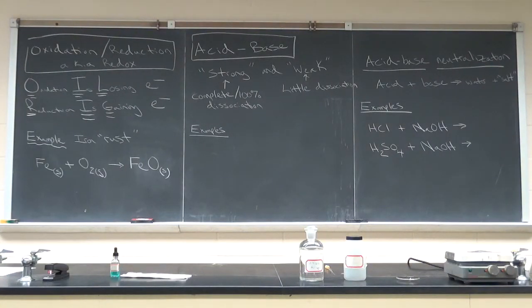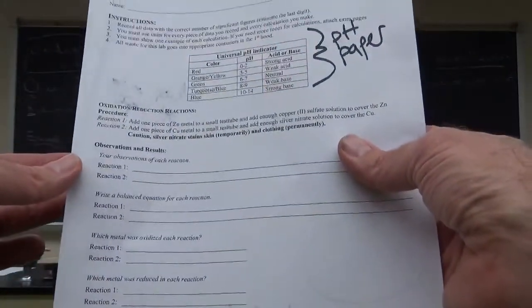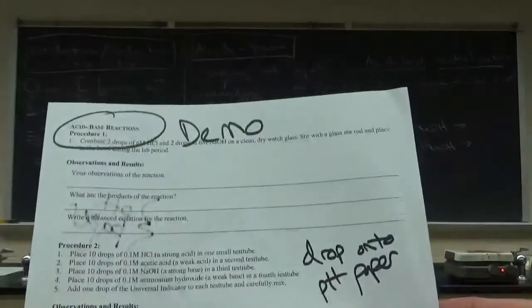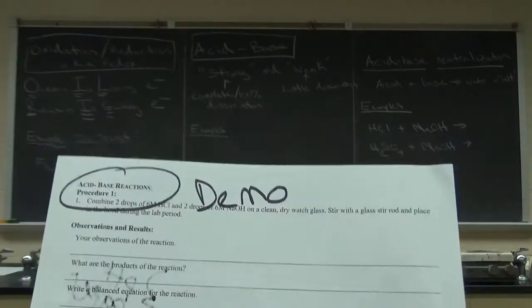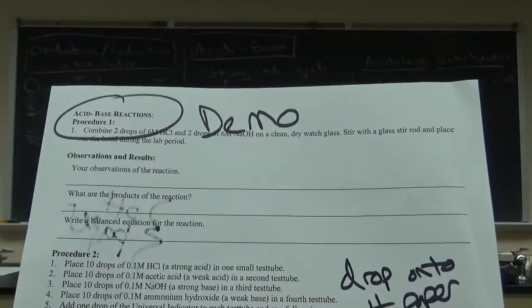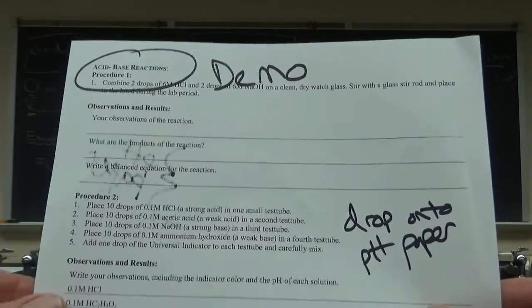So yeah, there's oxidation reduction. I'm going to do one of those with you now, in a slightly different way. And procedure 1 I'm going to do as a demo right at the beginning. It just takes too much time to let the reaction sit there. That's fine, so I'll do that as a demo and I'll talk about that.